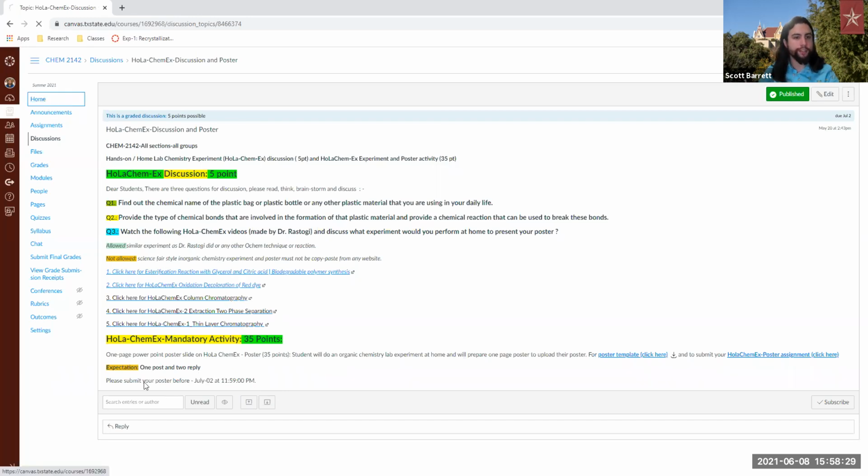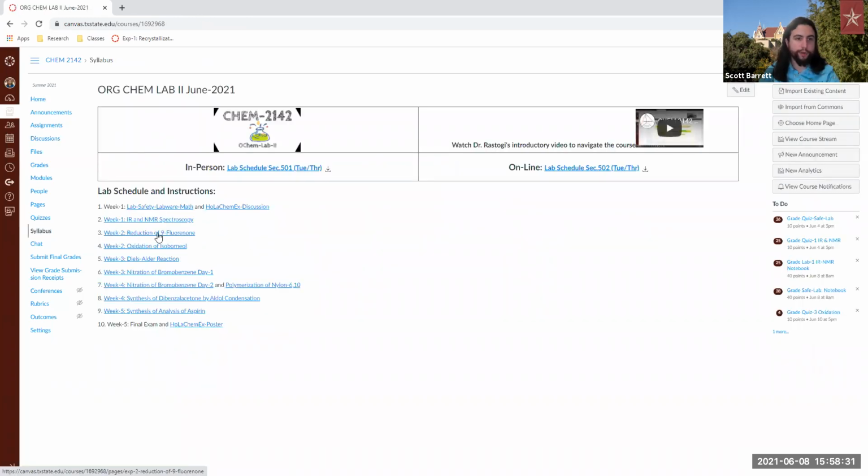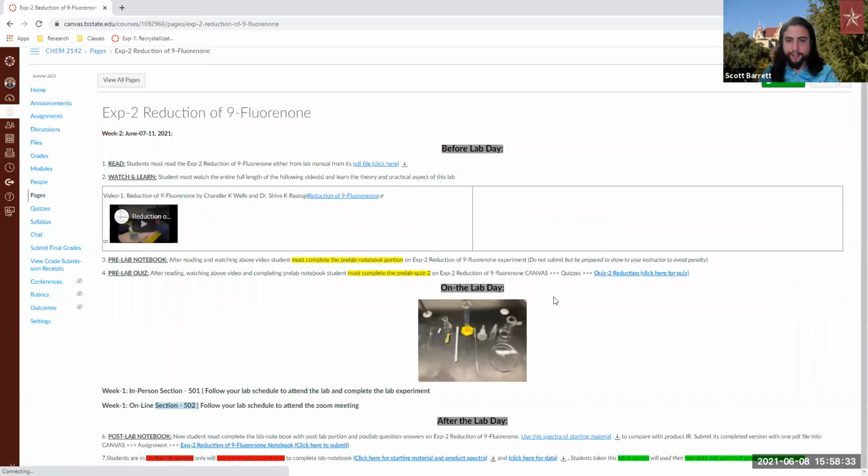And then otherwise, I'm going to just come back to our reduction and make sure that I didn't miss anything. Make sure to list out all the glassware that is provided within your lab manual. All the glassware will be in your apparatus. Only the oven, the IR machine, and the, what was the last one? The melting point machine will be the 3 machines that you need in the section today.